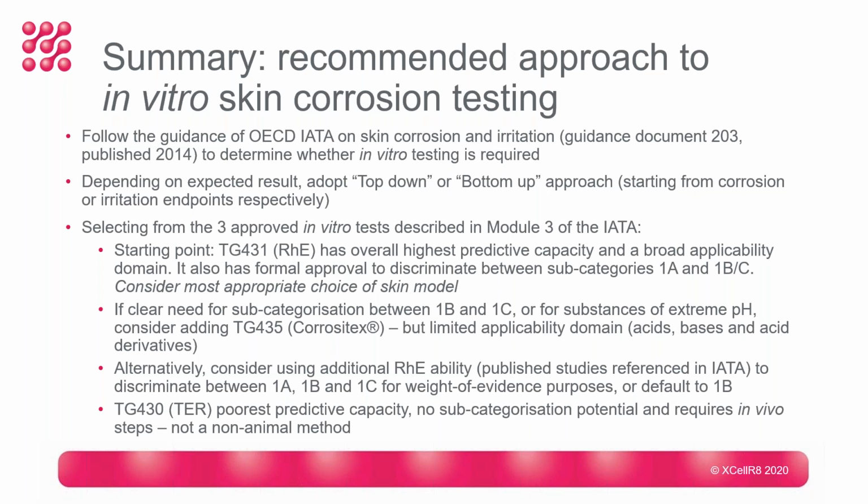And then if from your weight of evidence you decide that further testing is required, depending on the highest probability, your most expected result, you would then decide whether to adopt the top-down or bottom-up approach, which starts from corrosion or irritation endpoints respectively.